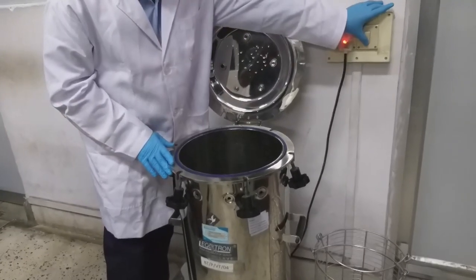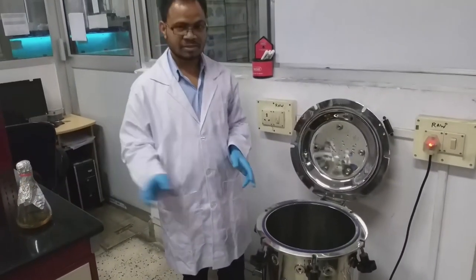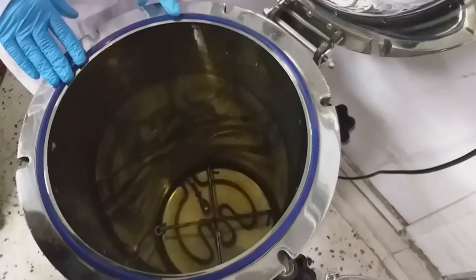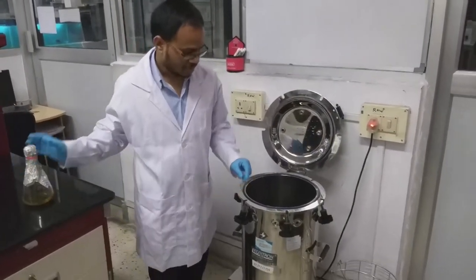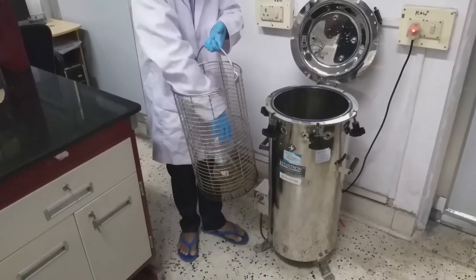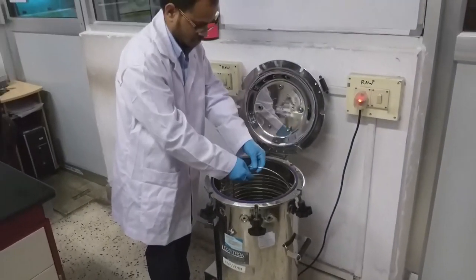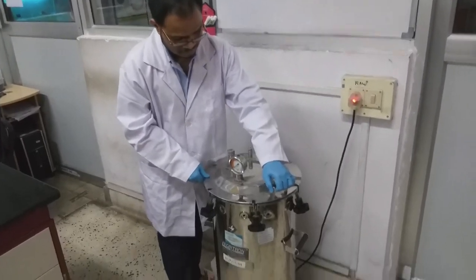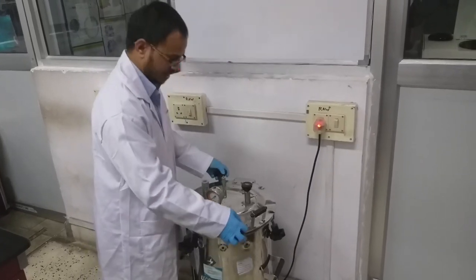We have to turn on the autoclave. So you can see here the bulb is glowing. Before keeping the media components in the autoclave, make sure that the heater inside the autoclave is submerged with water. Now I am going to keep the media components in the basket which we use for autoclaving. Then keep this inside the autoclave. While closing the autoclave, make sure that you are closing in the opposite direction.